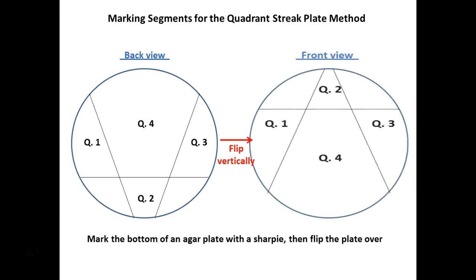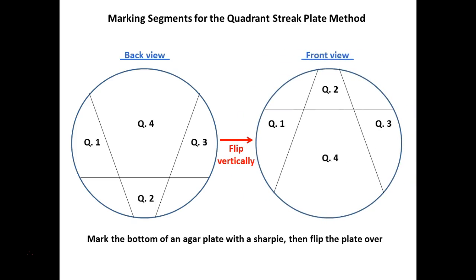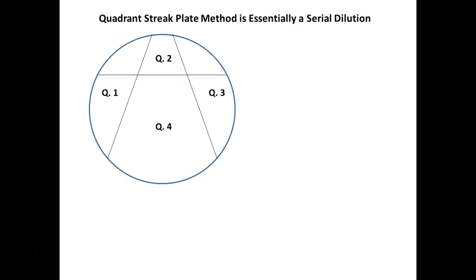Where are you going to actually draw these guidelines on your plates? On the bottom of the plate where the food is. Never write anything on your lid, right? These things could be separated from one another. So, especially if you're dyslexic like me, it's kind of hard to write the numbers when you're writing them on the bottom, right, so that you can see them when you're looking through the top. So I'll teach you a trick on how to do that so that you can distinguish one number from another and keep track of what way you're going.